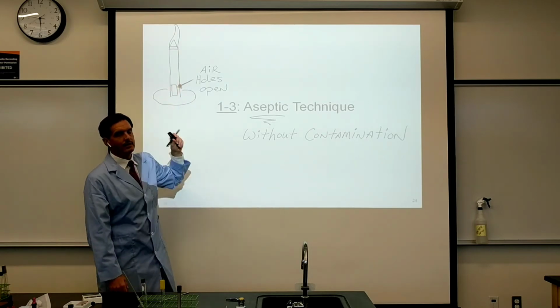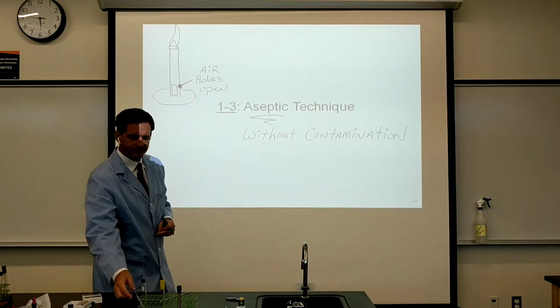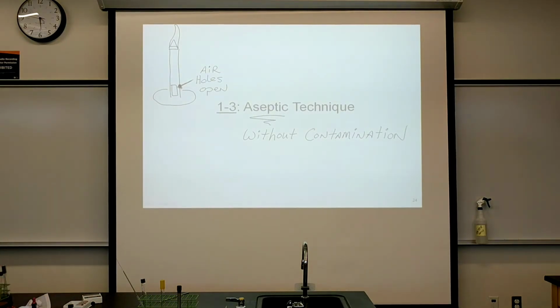You get all that right and you're going to be looking for this inner cone to be there. What we're going to be doing is aiming to work at the tip of the inner cone. So always work to flame objects at the tip of the inner cone. This is the part that we're going to label as the hottest, and that's where we want to aim.